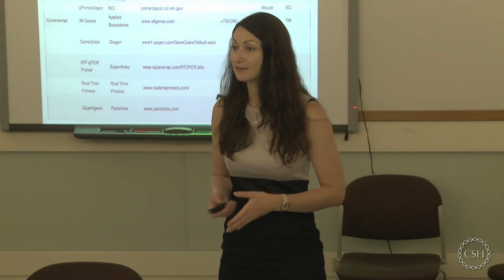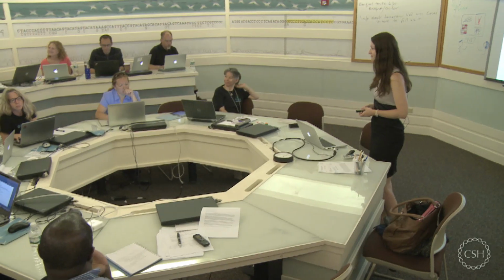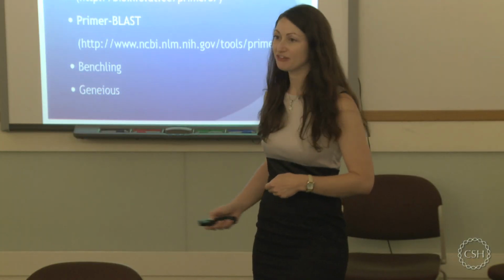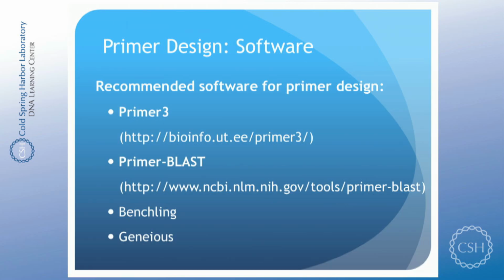Do you have a favorite website for primer design? Like I use IDT. Yes, I do. I guess the most famous one is Primer3. I have only one web page here, but it's open source, so many other universities use it. There's definitely a link at MIT and then probably at any university everywhere, they're all using Primer3. And it is pretty good. These are completely free.